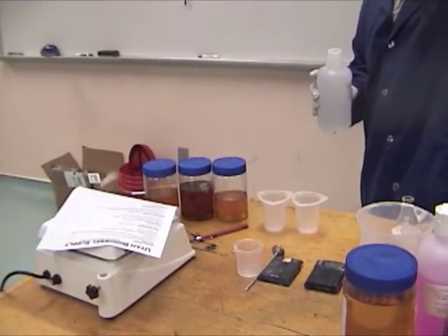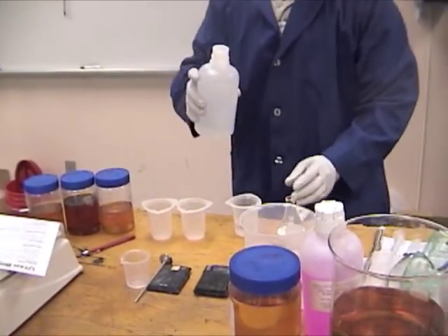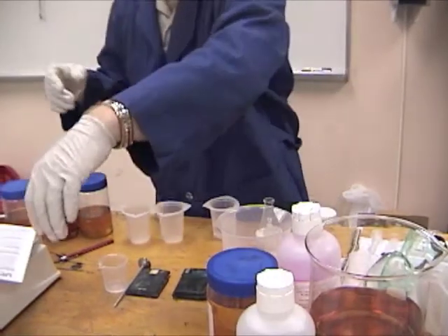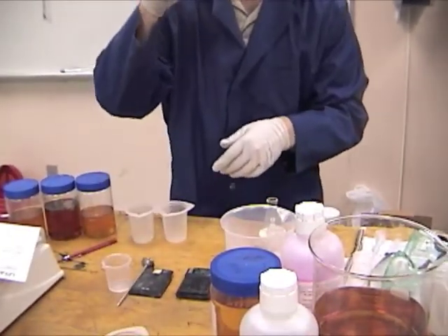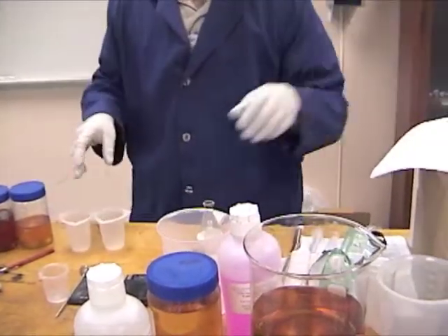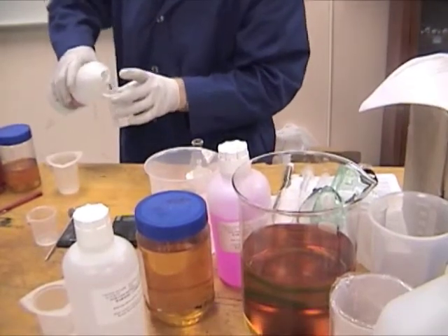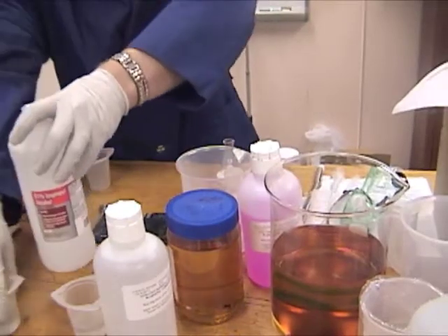So I'm going to add some titration solution. Now, I didn't dip a syringe in here and pull from it. That's important, okay? So there's my titration solution. The amount makes no difference in this cup because I'm going to draw from that cup into the set, which is what I do. Right, there we go. That's smart. I'm going to add a little bit of isopropyl alcohol. Again, it doesn't really matter how much is in these because these aren't my measured amounts.